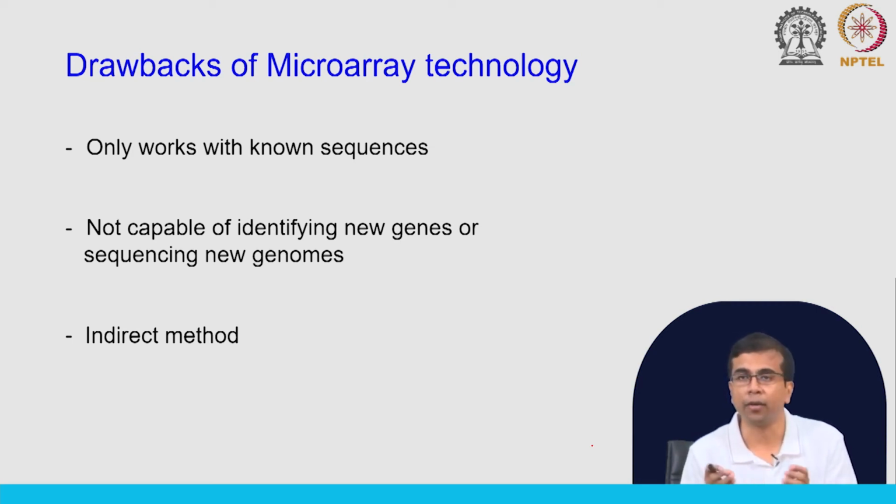We have not discussed all the details about the conditions in which we do this hybridization. These conditions are also very important in determining the hybridization efficiency.